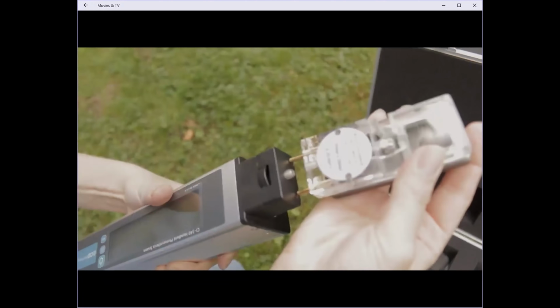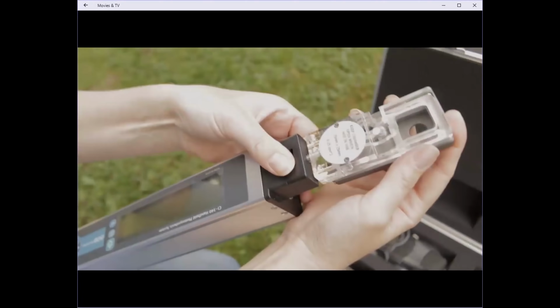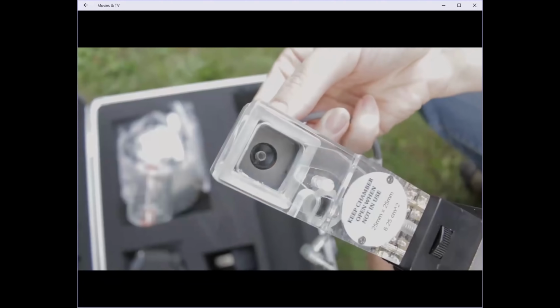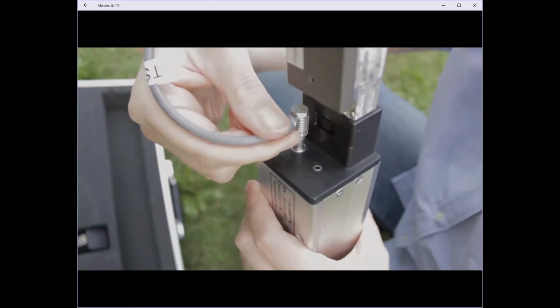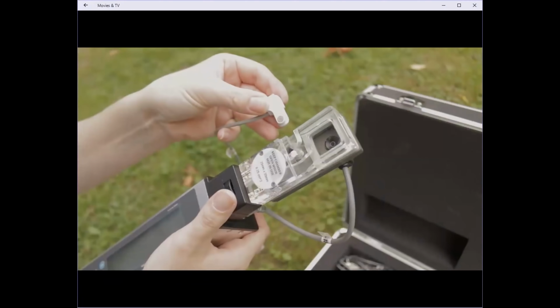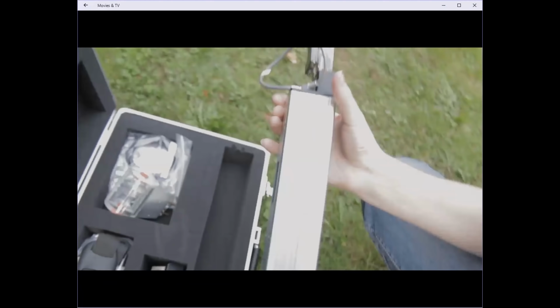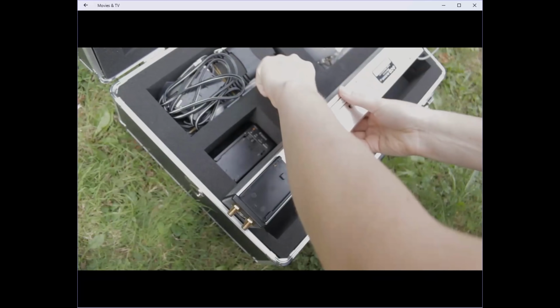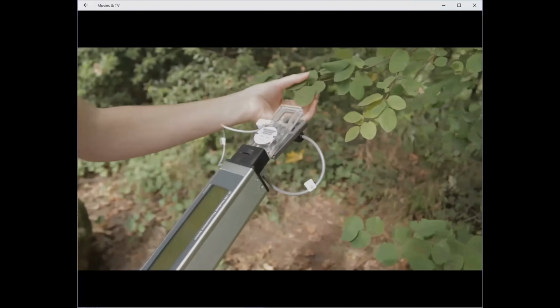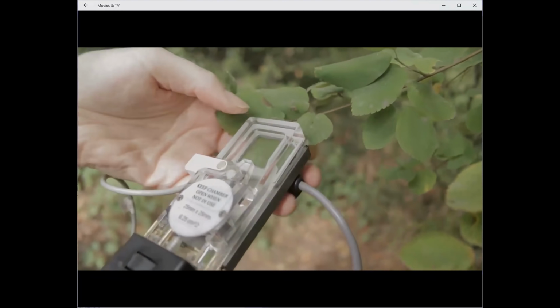To set up the instrument, first attach the leaf chamber. Then attach the temperature sensor. Next, attach the photosynthetically active radiation, or PAR sensor. After installing the rechargeable battery, you can then power on the instrument, attach the leaf chamber to your leaf specimen, and after a brief warm-up, the instrument can begin collecting data.